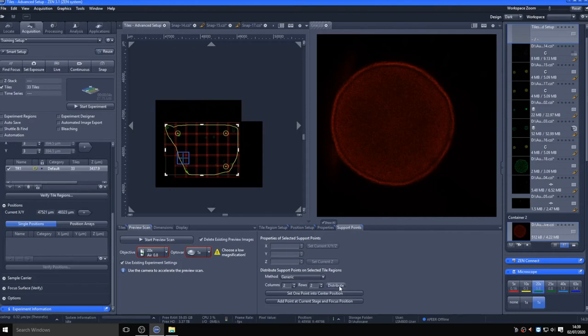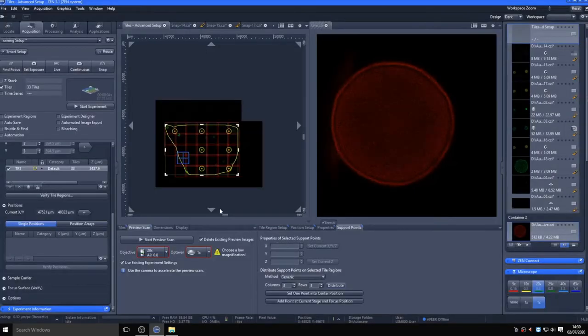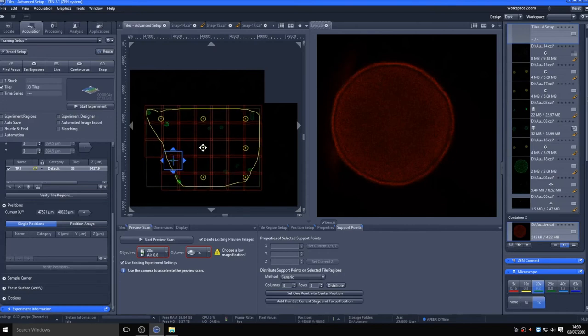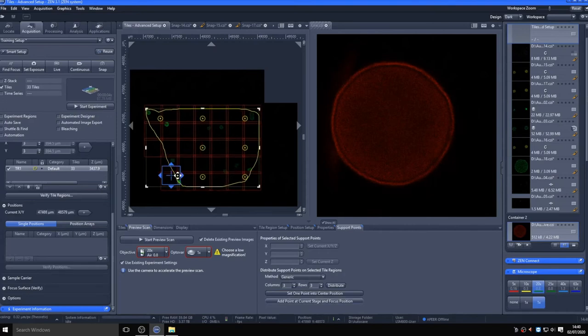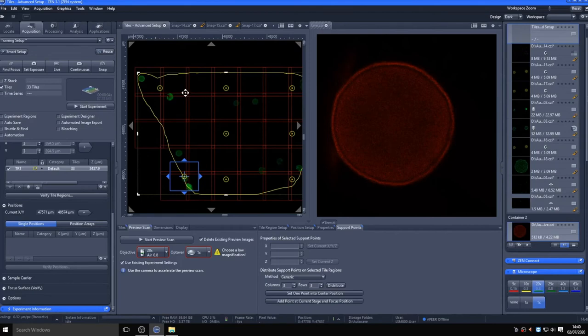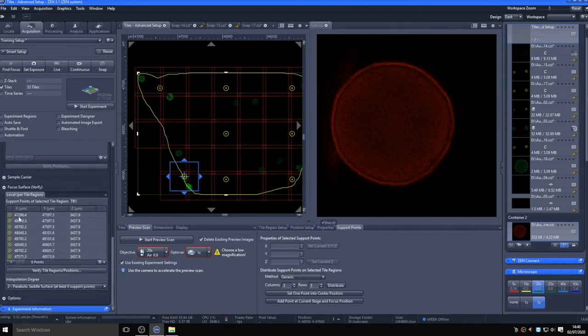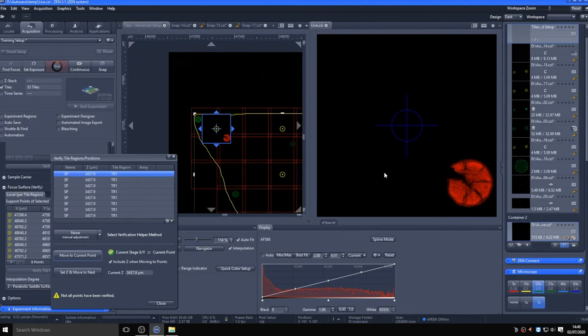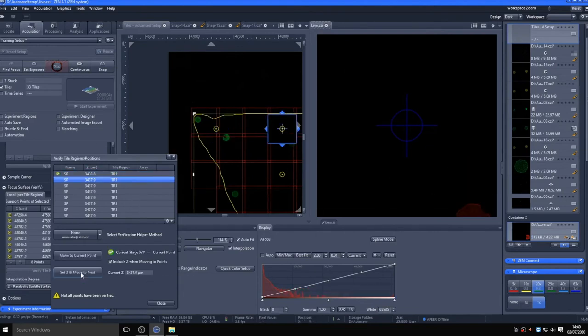You can add support points in a grid or at selected positions within a tile region, and these appear as yellow target signs within the tile region. Each position needs its Z-plane verifying. Do this by expanding the focus surface section of the tiles tab and click Verify Tiles Regions/Positions. Click Move to Current Point to move to the first focus point. Go live and optimize the focal plane with the focus control. Click Set Z and move to the next, and repeat for each focus point, adapting focus as you did with the earlier positions. I've sped the video up here to save time. Click close when all are done.